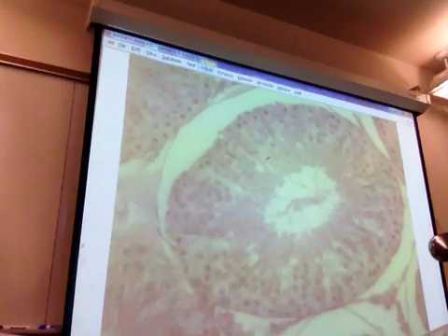And like I do that. See that? It's like a darker, almost like a darker streak. Yeah. So, like this would be the nucleus. Notice I can draw a line pretty much from that nucleus all the way up to the top.